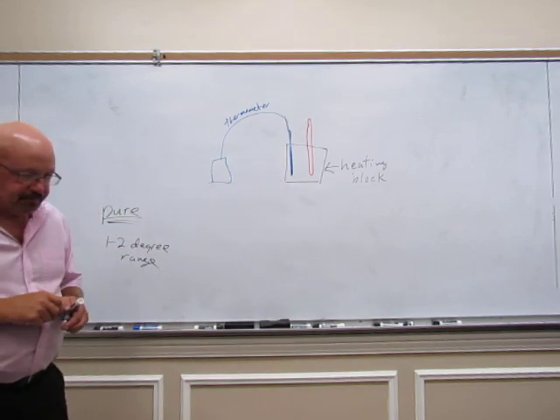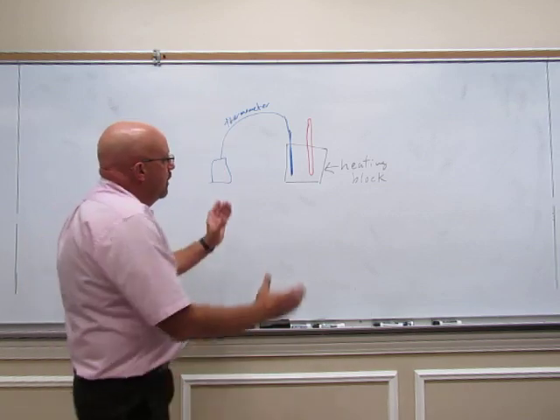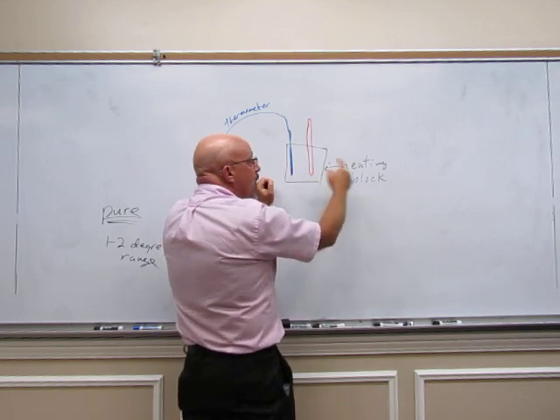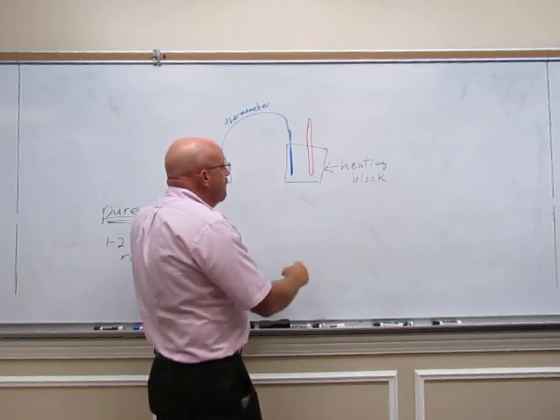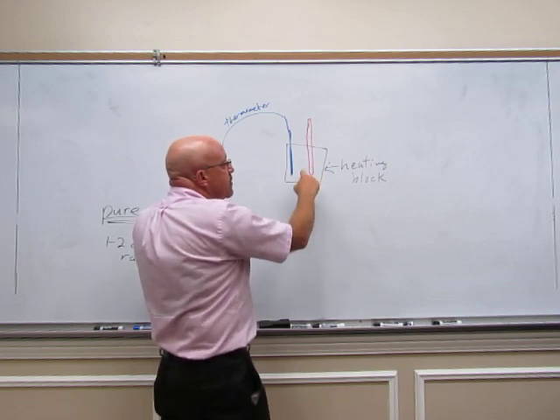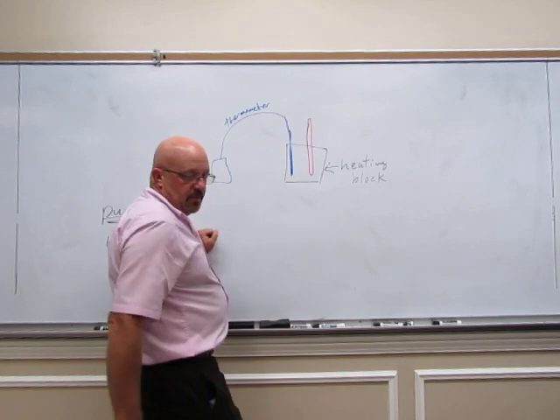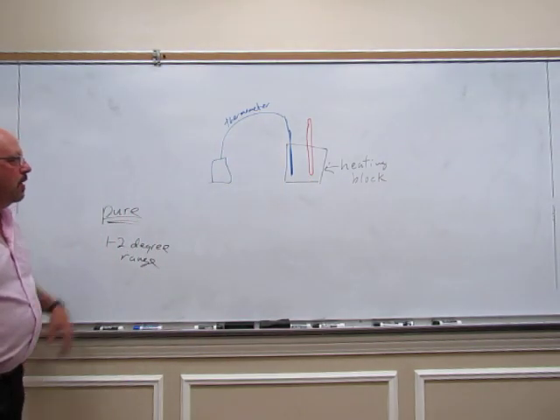Now, if we heat too fast, the heating block heats up very quickly, but it takes time to transfer that heat. The heat's not transferred instantaneously, so it takes time to transfer it into your sample. So that's a little bit of a delay. It also takes time for your thermometer to read that temperature, for this to transmit the reading back to our digital readout.